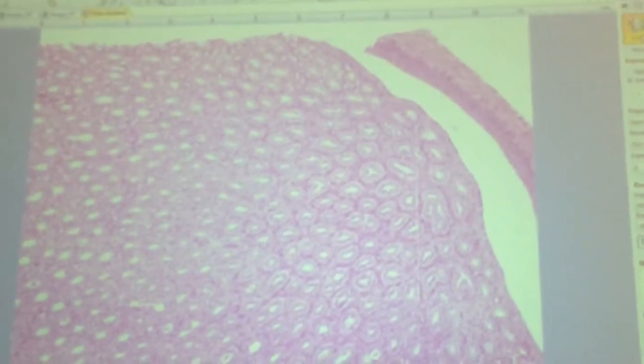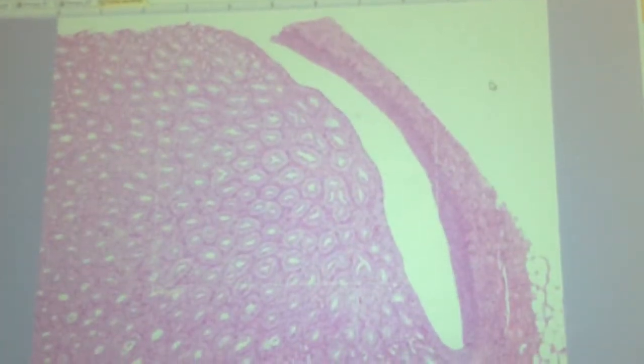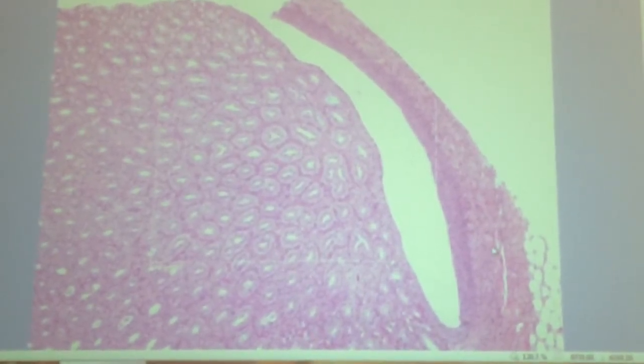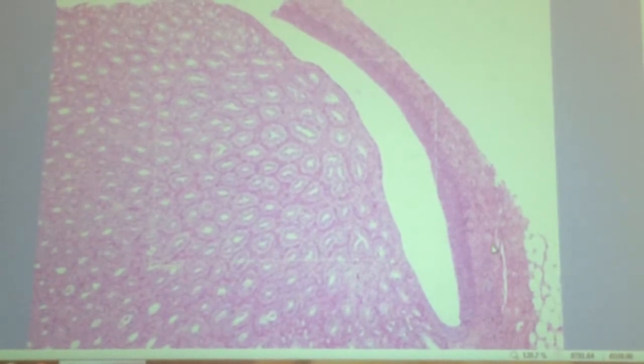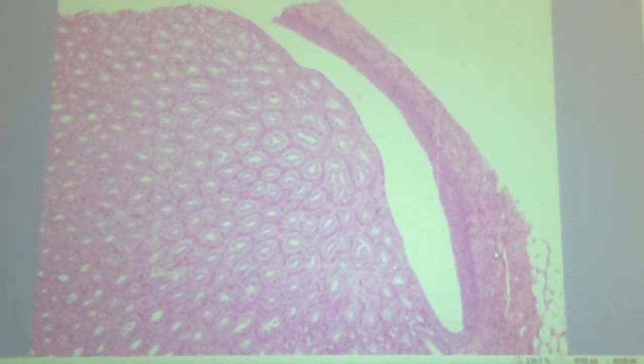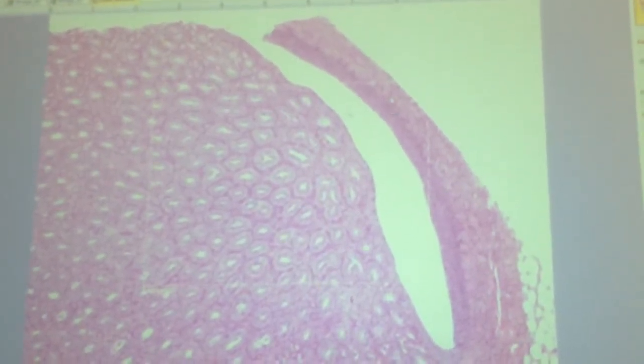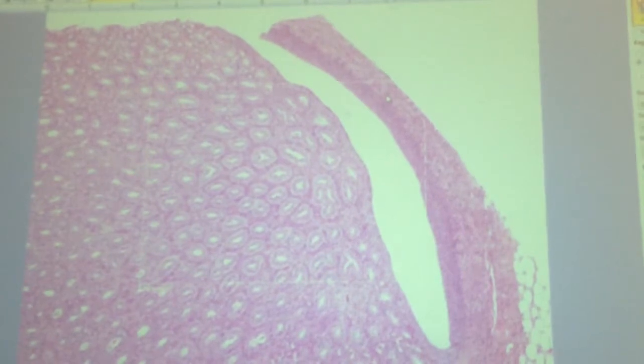Okay. What would you find in a papillary duct? What would be in here? Urine. Okay. This area right here is the space around the renal papilla, the tip of the pyramid. And down in here, this is a section of one of the calyces. You can kind of see it up in here. This is part of a minor calyx. Calyx is English, American and British, they're all English. It's tricky to wrap your head around which one is the correct terminology, so they're kind of interchangeable.